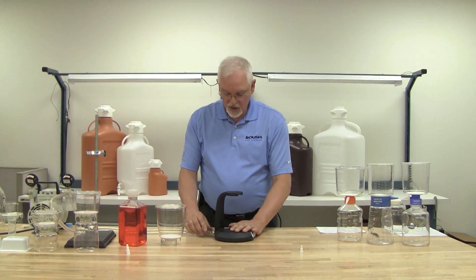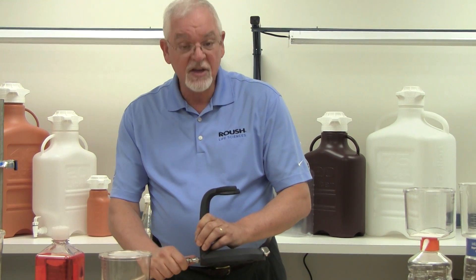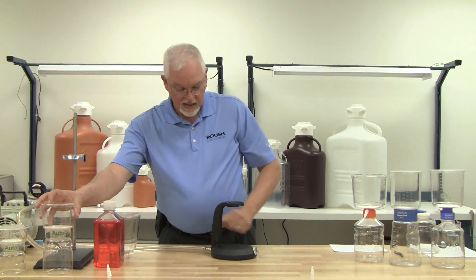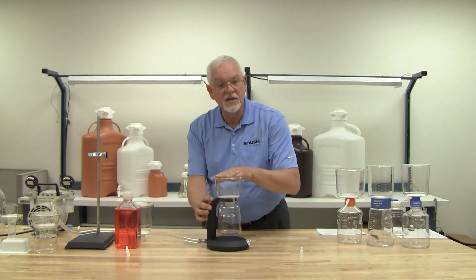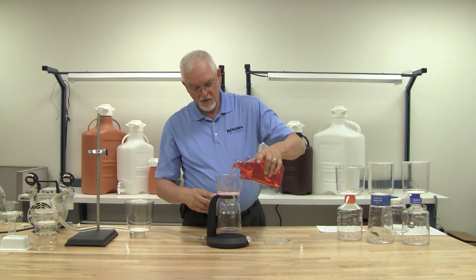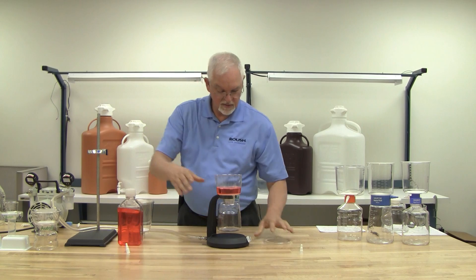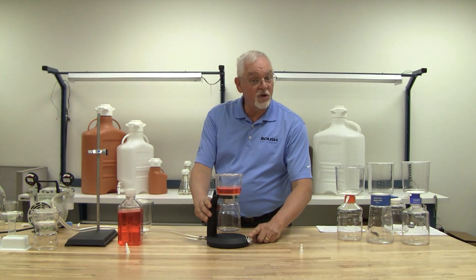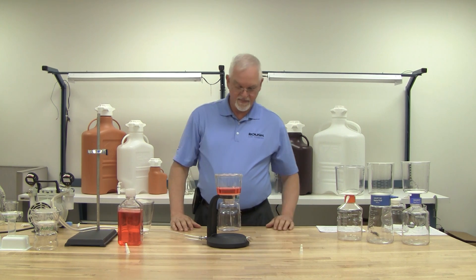This is our pedestal. You can see that you only need to connect the vacuum tube to the back of the unit once. Then you can take a complete unit — watch, it just drops simply right down into place. Note how stable that is; it doesn't have to move around at all. We'll turn on our pump. This is where the controller is to turn the product on and off. And off she goes.